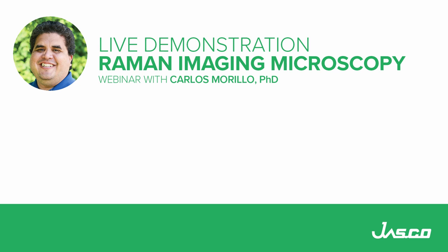Today we are going to be performing a live demo for Raman instrument.